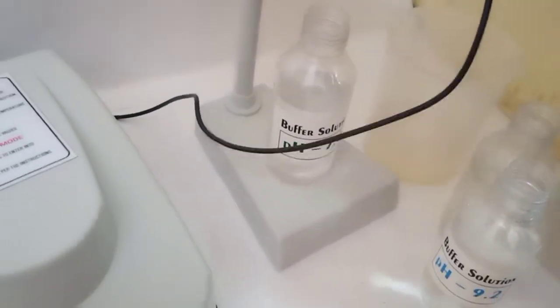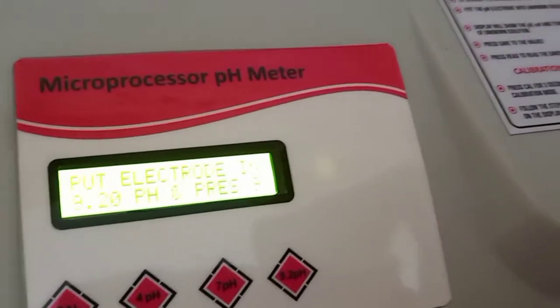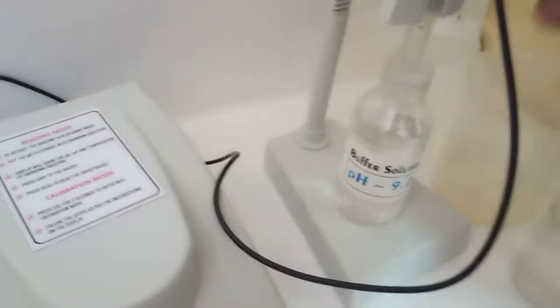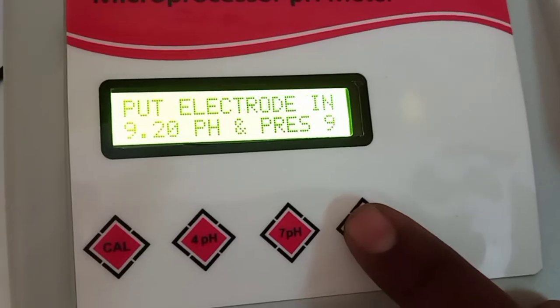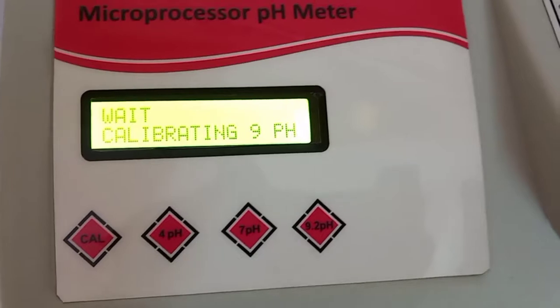Now the machine demands 9.2 pH. Again, wash the electrode thoroughly using distilled water — make sure to use distilled water. Put the electrode into the 9.2 pH buffer and press the 9 button. Again, the same process — we have to wait.